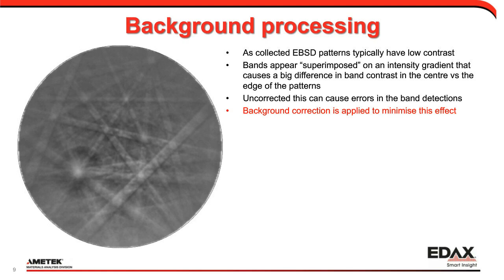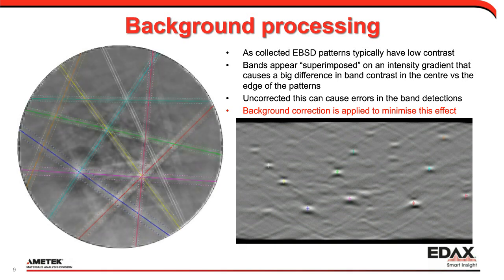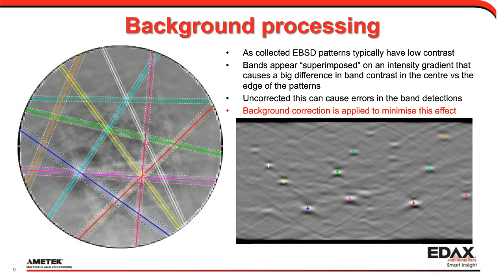Let's go ahead and look at the Hough itself. Now I can see those spots stick out much more strongly, and the Hough is able to easily find that. Now, in this case, I believe one of the bands was initially a fake band with a bad contrast. Our indexing method can usually get rid of that, but in this case, it's always best to start with your best Hough. And in this case, again, we can see the Hough is doing a great job. Also, if you look at the Hough, you can see there's another 5 or 6 lines it could find because the contrast now exists.